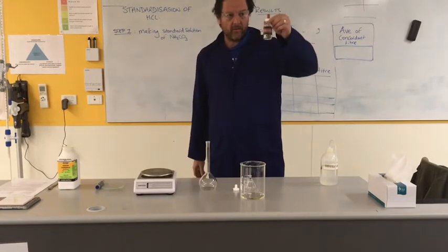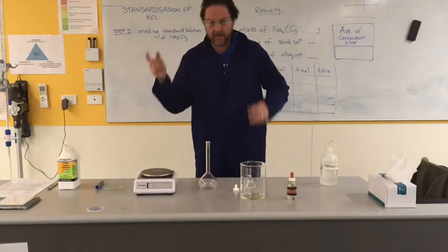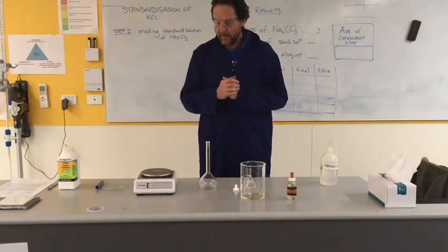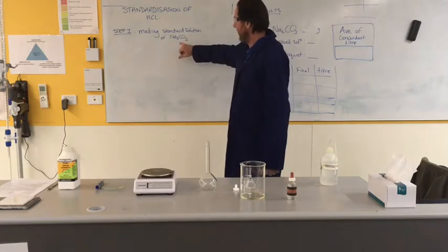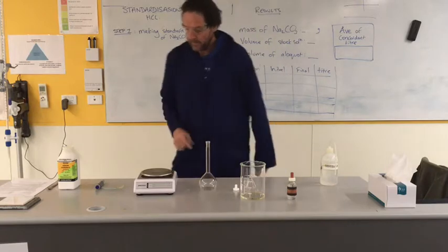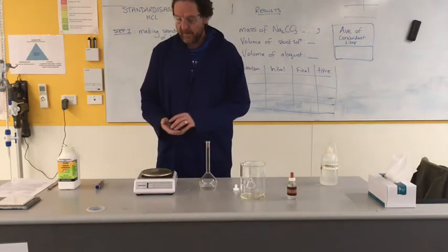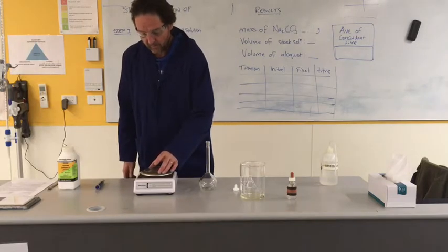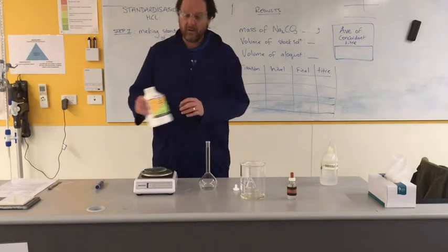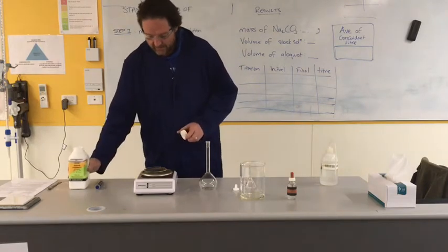The way we're going to find the concentration of this acid is to see how we titrate it against a known base. We're going to pick a base to make a standard solution of, and the standard solution we're going to make is of sodium carbonate. Sodium carbonate is a very good choice because this is anhydrous - we've kept it in a desiccator overnight, so we've got rid of all the water. We're very sure of its molar mass.